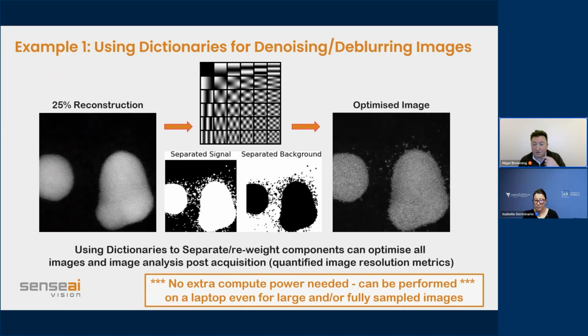So I mentioned in the presentation the idea of using it for ultra-fast TEM. The biggest problem with doing ultra-fast TEM is you don't have enough electrons to get high resolution. But if you use an in-painting mechanism for the very low doses that are going into there, you can improve the signal to noise in your acquired images, and then that will give you a higher resolution image for the same dose. Now, the gain is not as much as for the STEM, because in the STEM you're trying to do a sequential acquisition, but it does improve the images that you get and gives you a better signal to noise.